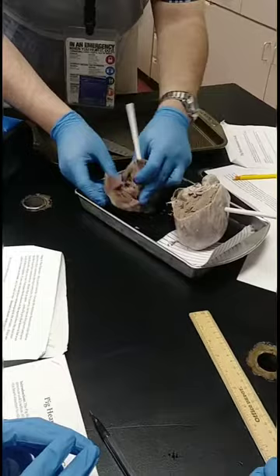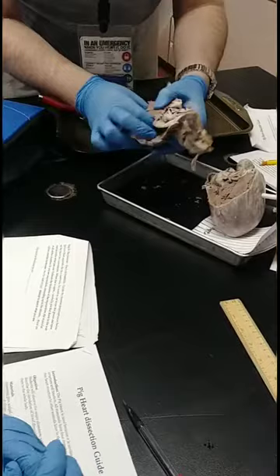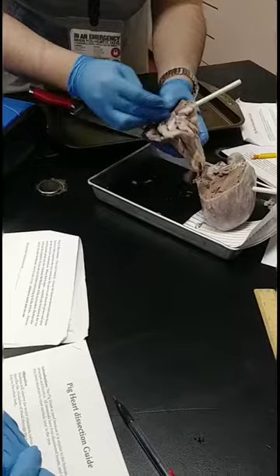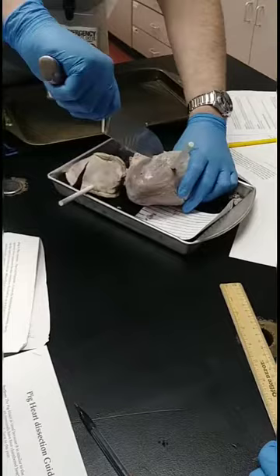That's the thickness of the wall. And if you look, it connects up here to the atrium over here, the auricle. That's what covers the atrium. Okay? You have some more veins. This is a vein connecting. These are heart strings. And over here on the left side, let me see how much thicker it is.